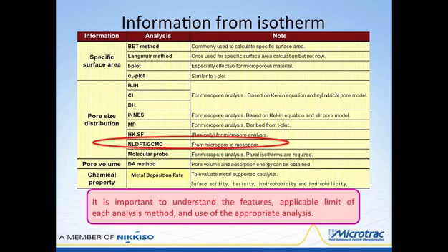Each one of these is somewhat specific in its use and its application. But one thing to note is that, for instance, these three calculations here are applicable just for doing an analysis for mesopores. And this is based upon the Kelvin equation and a cylindrical pore model. Now down here, the Innes method, this is for mesopore analysis.